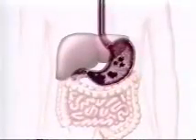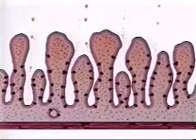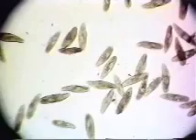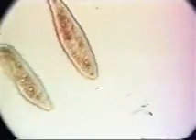An acidic environment speeds up enzymatic digestion. In humans, glands in the stomach lining produce hydrochloric acid, making enzymatic digestion more efficient as food progresses down the intestine. Smear a small amount of neutral red stain on a slide and allow the alcohol solvent to dry. Add Paramecia. As the stain is taken up, regions that are acidic turn red, the food vacuoles.